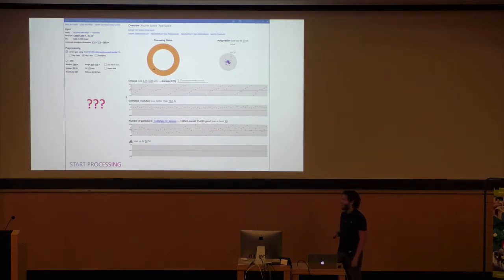So you can pretty much only estimate the CTF after manually importing pre-aligned tilt series from IMOD. And that's it. Everything else related to tilt series in Warp has been delegated to purely offline tasks. So there is no way to do on-the-fly processing with that.